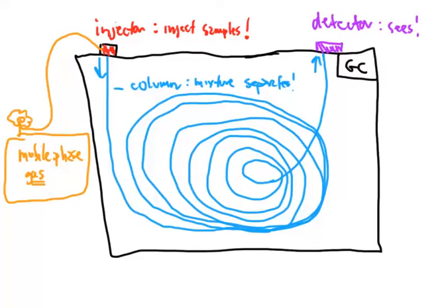All right. So that typically is the overall schematic of the GC system. Now, these things can get more complicated than this, but at a bare bone minimum, this would do a pretty good job. If you could describe this to someone, then you've done a really good job talking about how gas chromatography works.